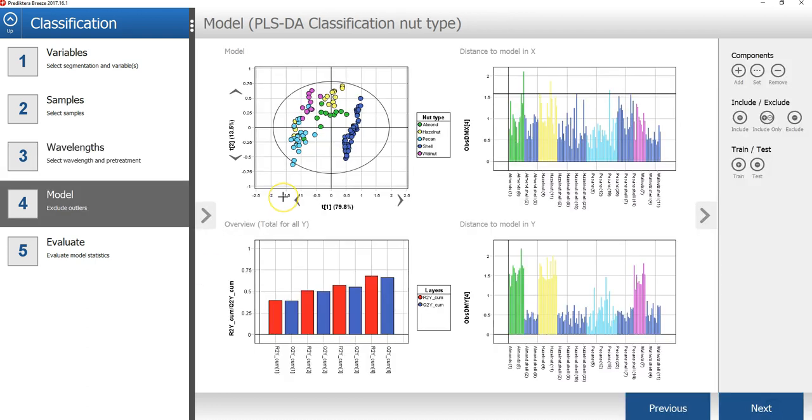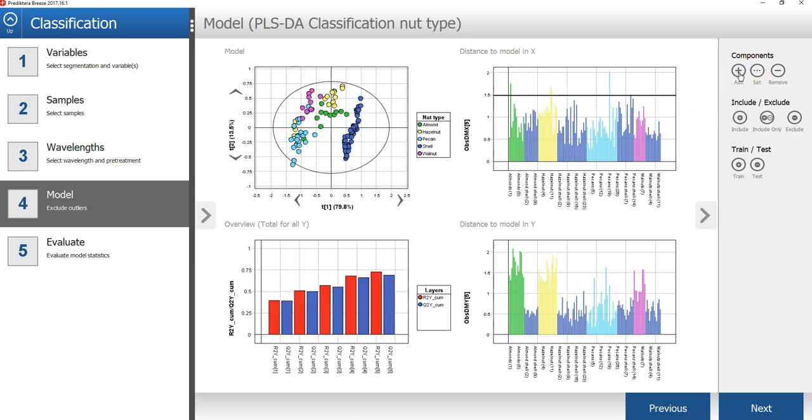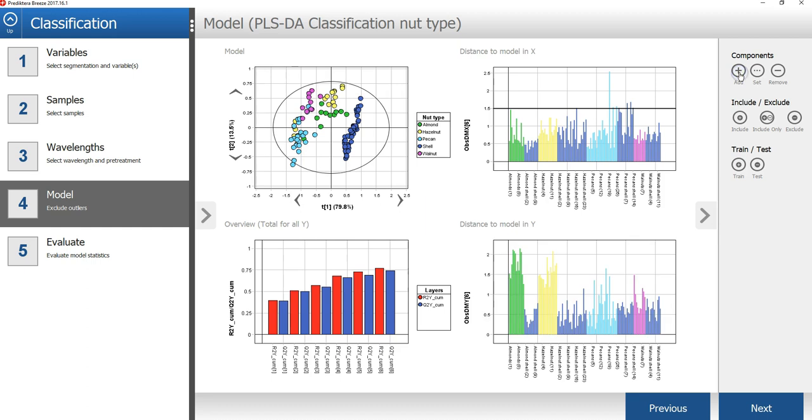In the fourth step of the wizard, a PLSDA classification model with 4 components has been built automatically using the autofit function. Under components, I will press the add button twice to add two more components. In the overview graph, we can see that the model improved slightly.